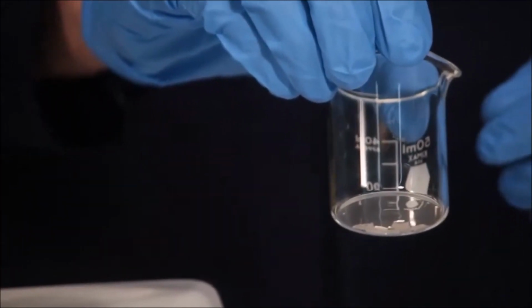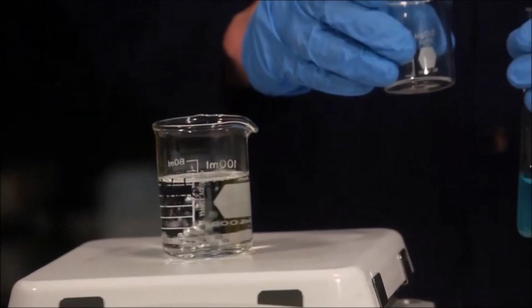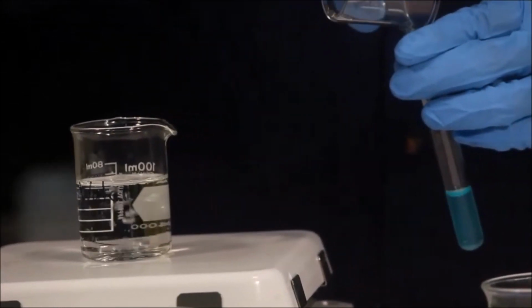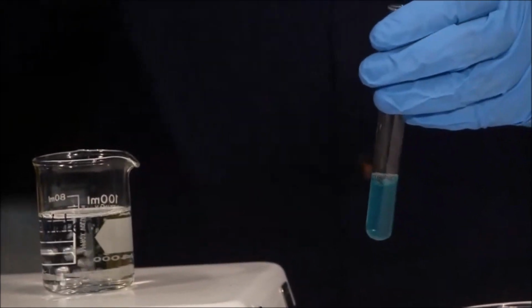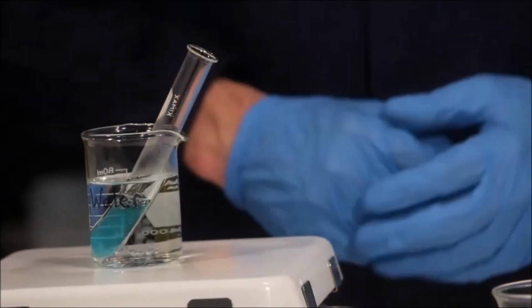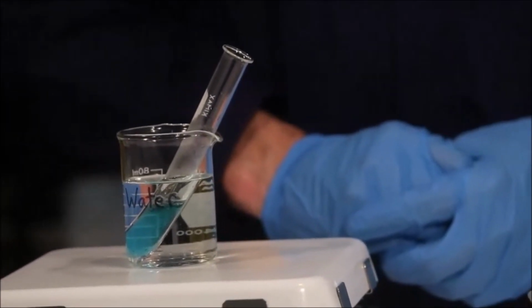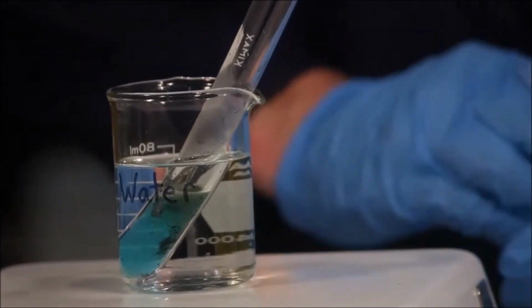Remember that you're doing this reaction in triplicate. We're showing you one example here, but when you're doing the reaction, you want to do everything 3 times. Next, add the magnesium metal to the test tube containing the copper sulfate. And then insert the test tube into a flask or a beaker containing boiling water on a hot plate. You're going to want to let this reaction continue for about 20 minutes.